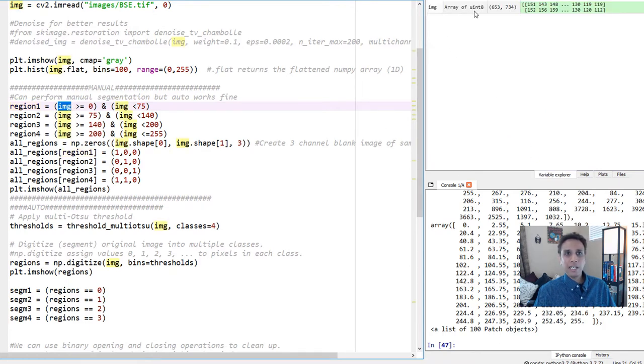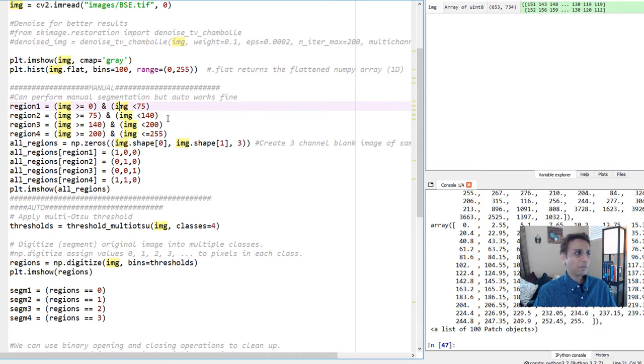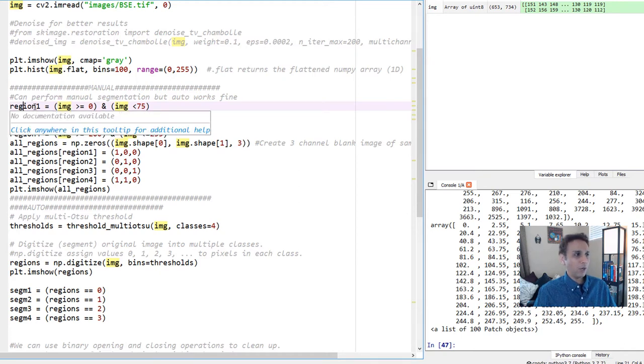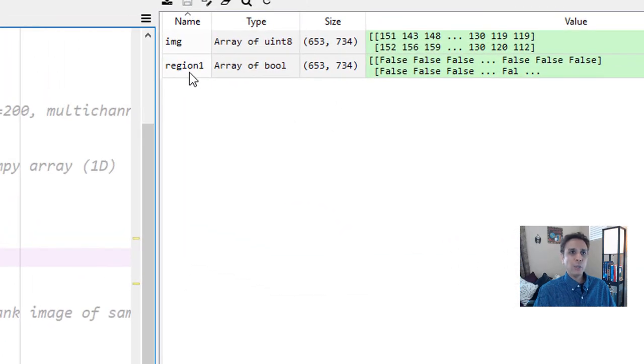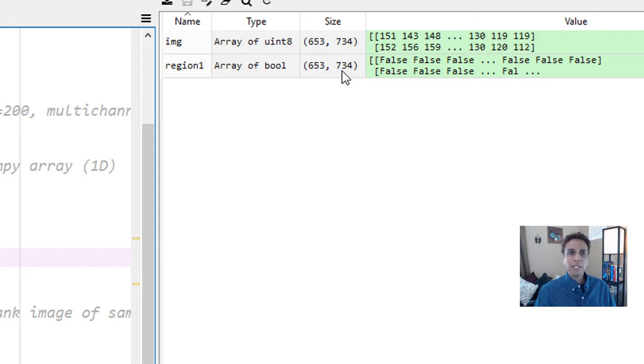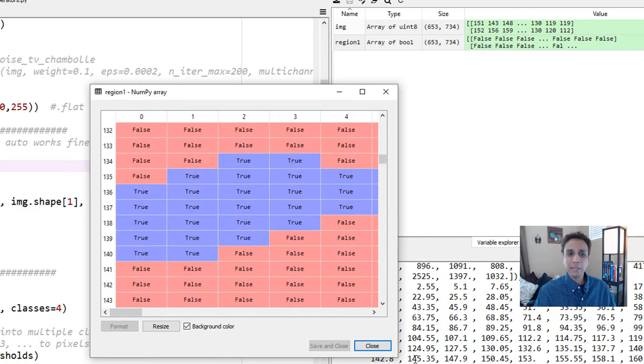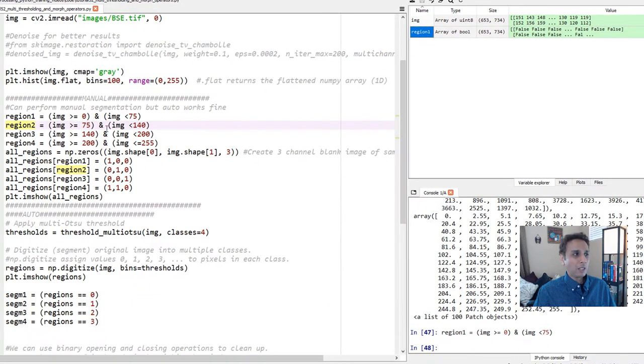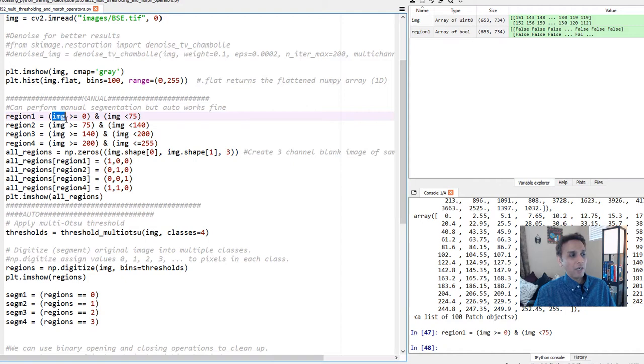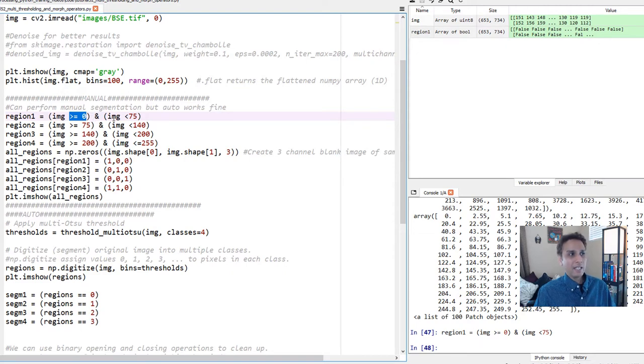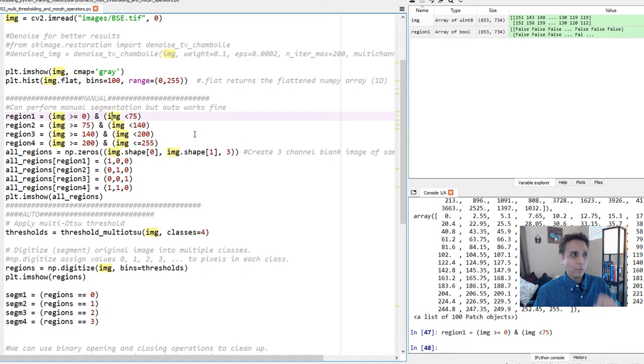Region one, I'm defining as all the values from my image. What is my image? It's an array of unsigned integers of size 653 by 734 with values between 0 to 255. Now I'm saying create a new array called region one. If I run this line, you should see it created a new array which is a boolean array of the same size as the original image. It's boolean because it's either false or true. If I open this, it should have false values or occasionally true values.